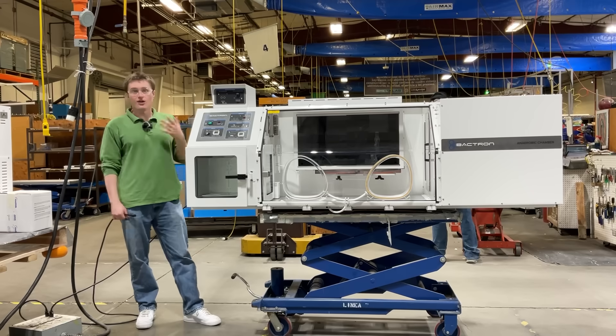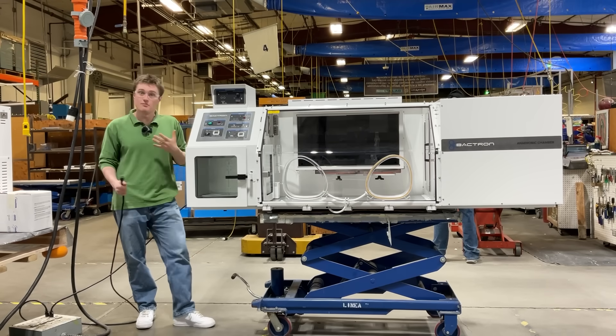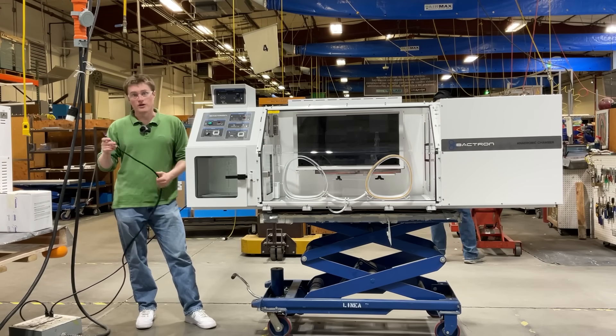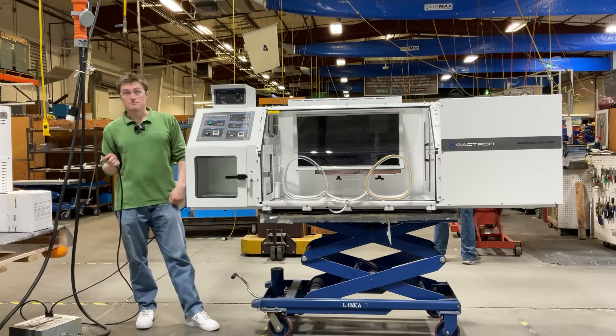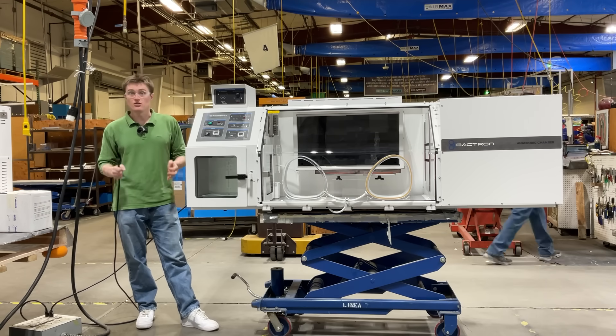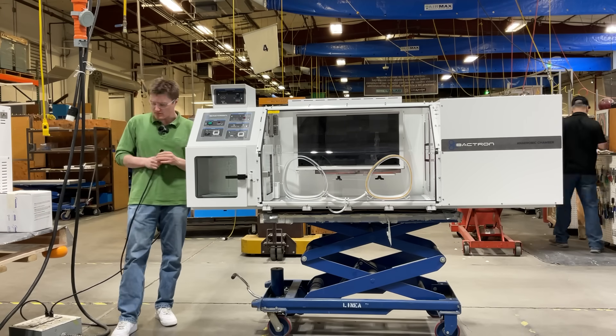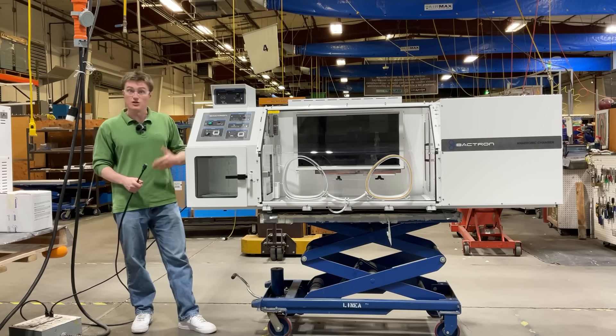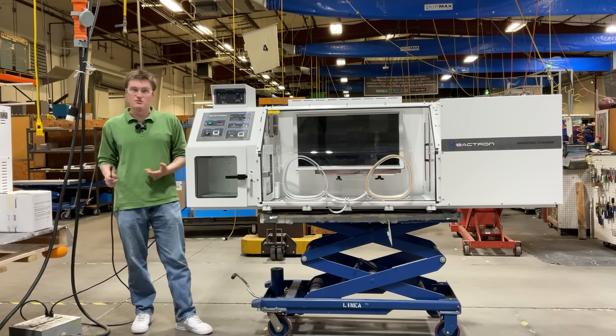Located on the rear of your unit, there are a couple of features, chief among them being the main power inlet. In each unit's ship kit, a power cord is included. This must be connected to a properly grounded electrical outlet for safe operation. For further information related to electrical safety, as well as installation instructions including clearances, please visit your user manual.